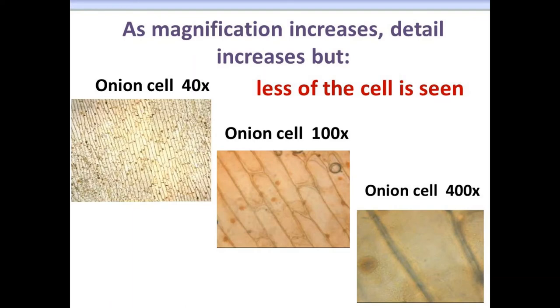Here is a slide of an onion skin. You can see many small onion cells using the scanning objective lens. While you can only see portions of the cell under high power, you can see more details such as nuclei and cell walls and other organelles.